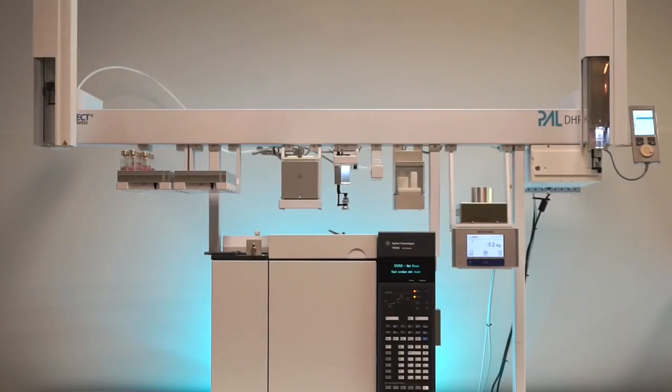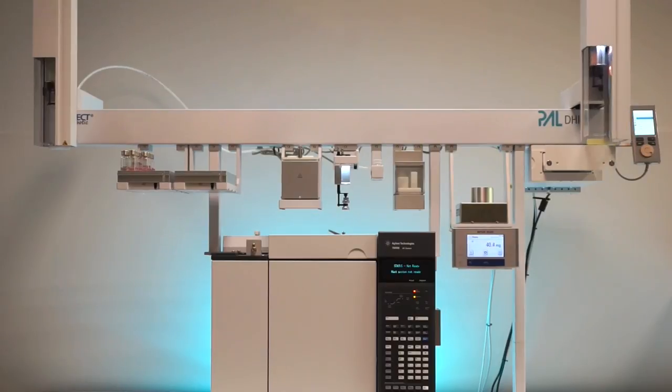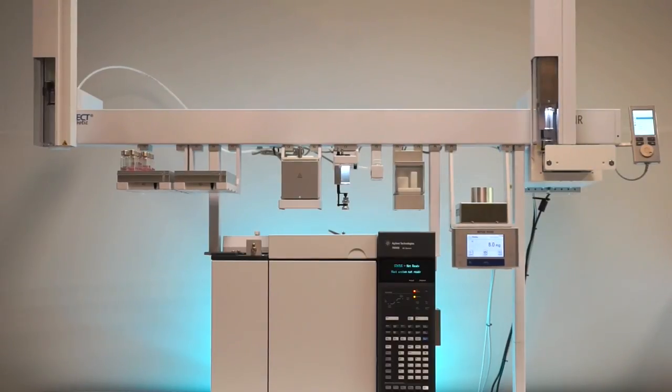The right arm of the autosampler, with an automatically exchangeable tool for liquid injection, attacks the 2ml vial with the internal standard from the cooled rack and transports it to the vortexer where it is homogenized at 2000 rpm.